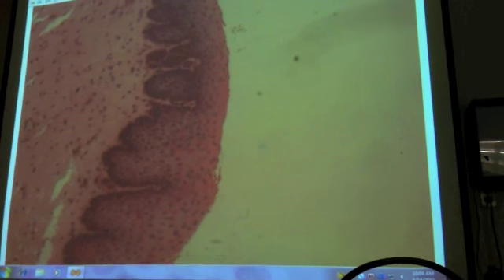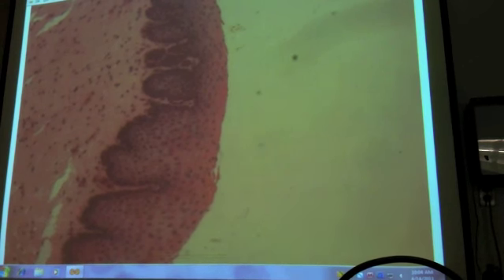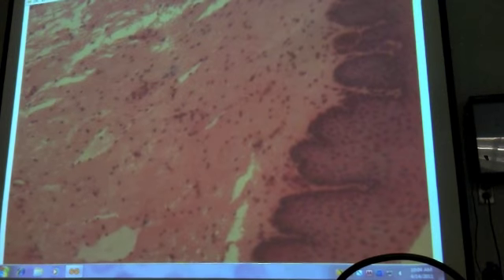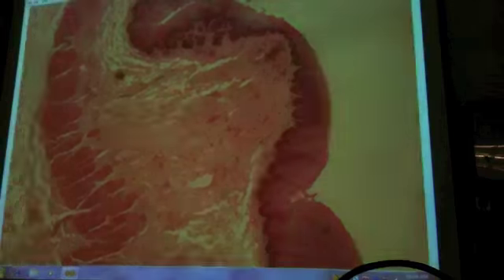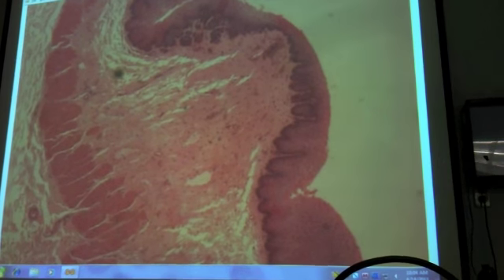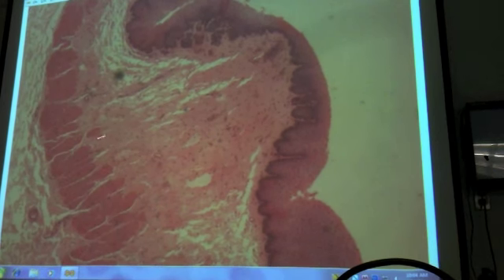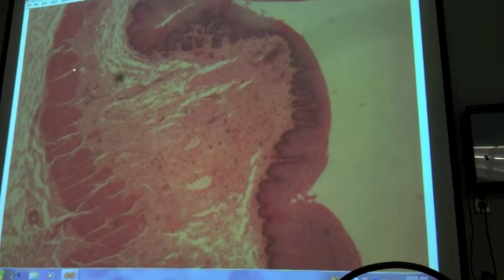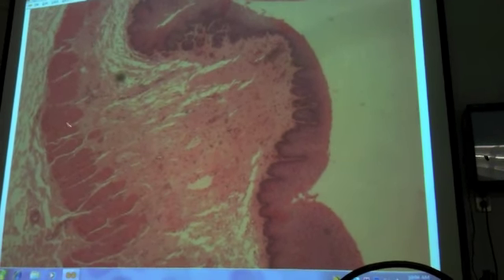There's our mucosal epithelium of stratified squamous epithelium wet. And I'm going to go to lower power. I think if I'm remembering what we're going to see. Yeah. So here is our lamina propria. And here is what has now developed into a pretty continuous layer of muscularis mucosae.